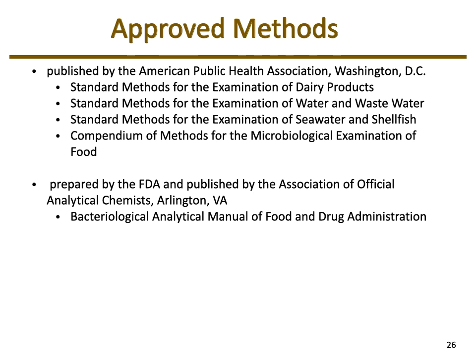So the thing to keep in mind is that there are published, approved methods for every area of the food industry, and some of that regulation comes from the FDA, and some comes from other public health organizations, so they have standardized methods. As you can see, there are standardized methods for dairy products, standardized methods for shellfish.